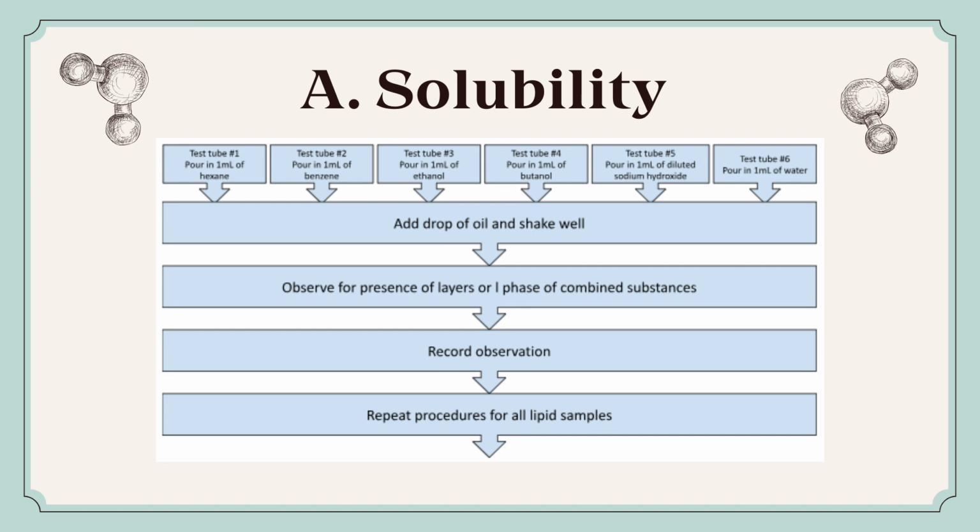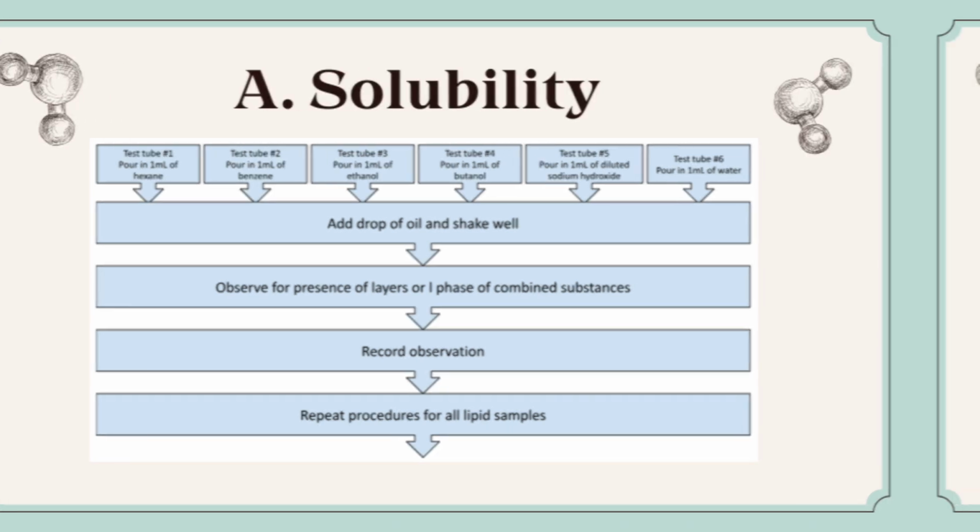For all the test tubes mentioned, we add a drop of oil and shake it well. After that, we observe for the presence of layers or one phase of combined substances. Then, we record our observations. We repeated the procedures for all lipid samples.